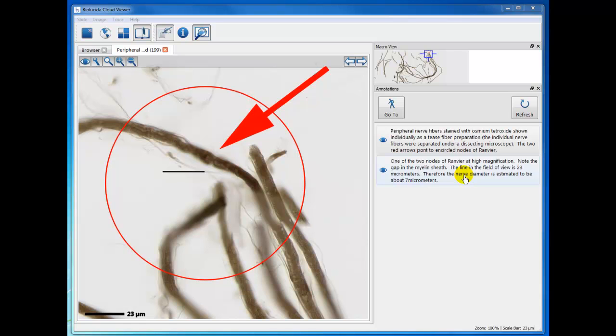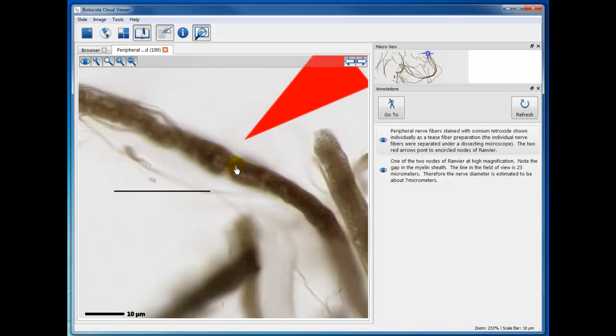Because a nerve is actually a compilation of many, many nerve fibers wrapped with the connective tissue wrappings that you're learning about. So this is a node of Ranvier, and again, if we enlarge this a bit, you can see the pinching in of the myelin sheath with the neurolemma, that is the outside membrane of the Schwann cell, still going across the gap, and then the axis cylinder going right through the center here. So you can't see those in detail.